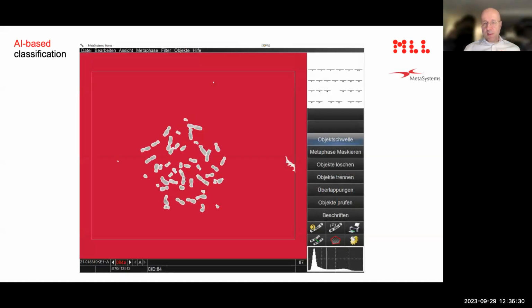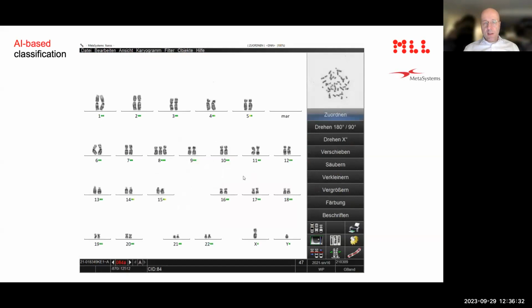It's just one click. You don't even have to work on that. A few seconds later, you're done with the same job. And we have automated this now so that we don't even have to trigger this process, but it works on its own once the data is on the server.